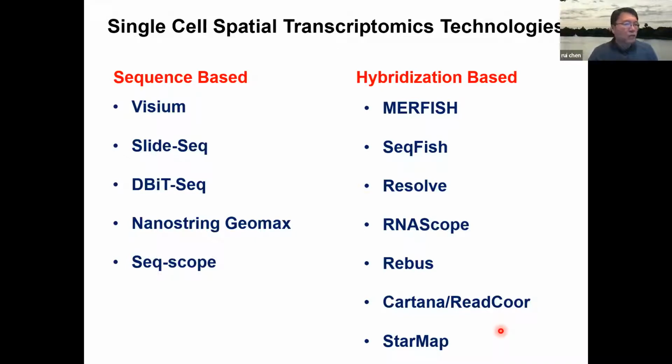They have a lot in common, and most of them require only looking at a panel. It is in theory possible, and actually in practice possible, to look at 10,000 transcripts, but in most cases you're looking at anywhere from tens to hundreds of transcripts once you have the panel. So the main limitation here is that you only interrogate the panel of genes you designed for.